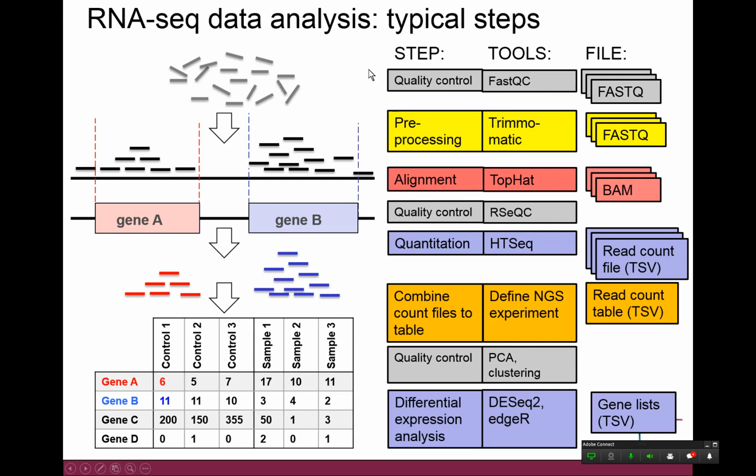In the very first phase, these raw reads are in fastq files, so you get those from your sequencing facility or sequencing device, and you usually get as many fastqs as there are samples, so there are a bunch of these files. Then you can, if you want to, do some pre-processing. For example, in our example session we use Trimmomatic to do some trimming to our reads. After that you still have a bunch of fastq files.